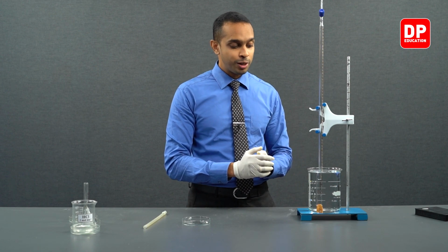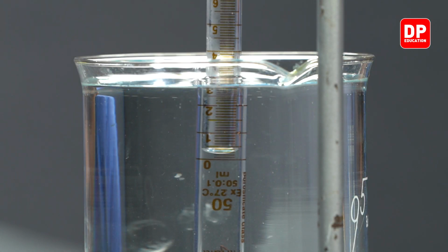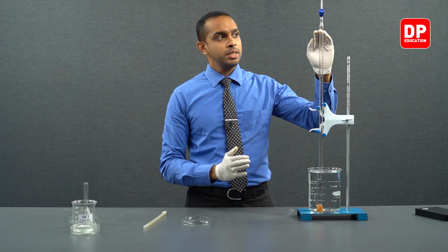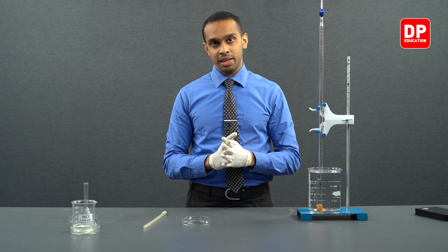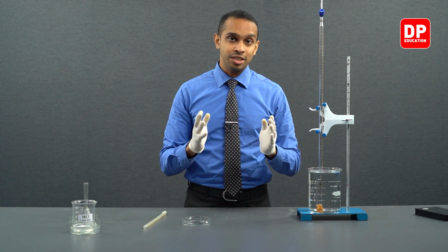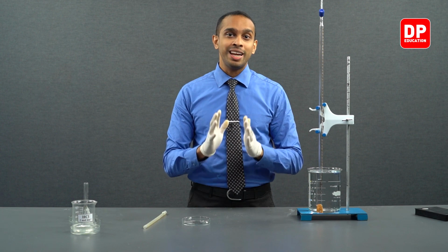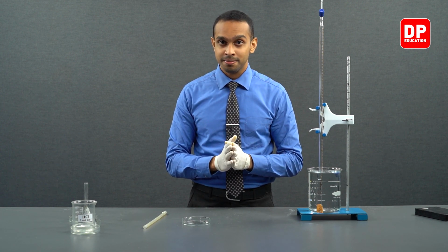Now, if you take a look at the reading over here, it is at 0.2 milliliters. We started the reaction by filling water all the way up to 50 milliliters. Now, the water level inside the burette is at 0.2 milliliters, meaning we have collected 49.8 milliliters of hydrogen gas.